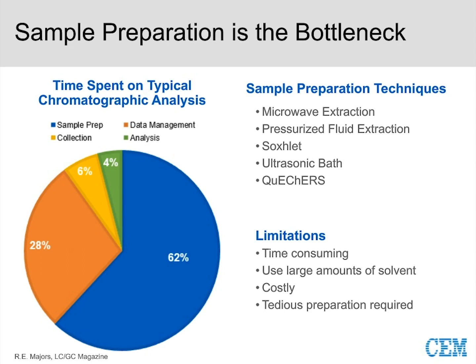And I fully understand the allure of QuEChERS. Any technique that is multi-residue, multi-matrix is certainly appealing. I mean, it's applicable to so many different things. So I fully understand why QuEChERS took off as it did. But as a whole, it's still a manual process, and I still think there's a lot of opportunity to improve and modernize upon that technique. Again, the limitations I've listed here are an exhaustive list for sample preparation as a whole, but so many of them, I believe, refer back to QuEChERS in general.